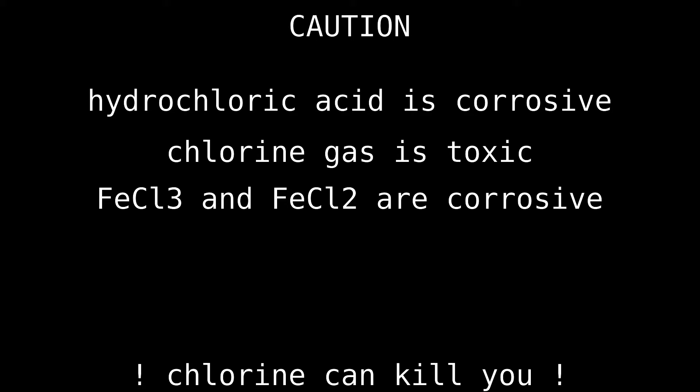In this video I am performing a chloro-oxidation of iron 2 chloride into iron 3 chloride. Work outside or in a fume hood. A gas mask is mandatory. Okay, now enough warning.